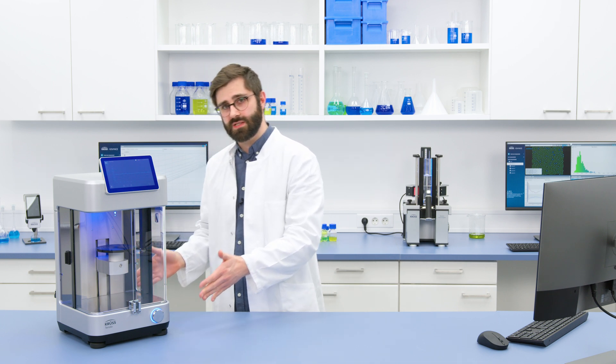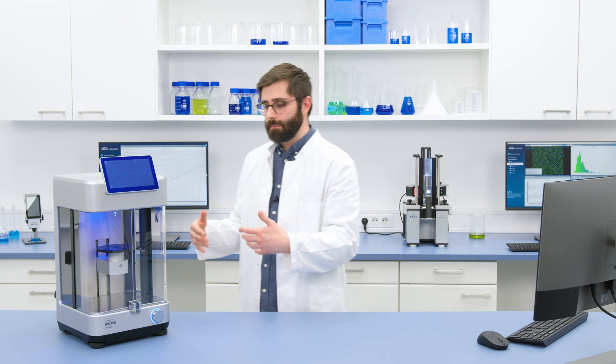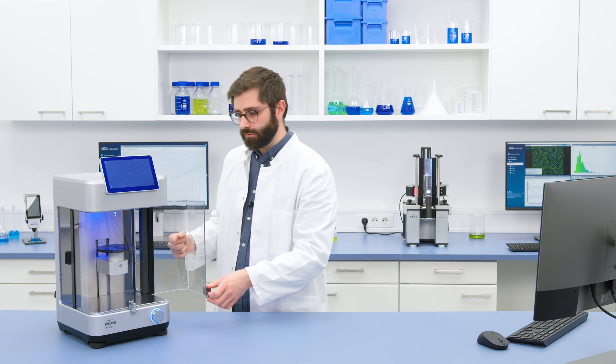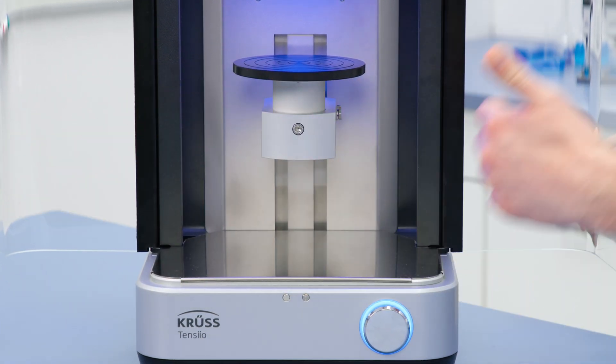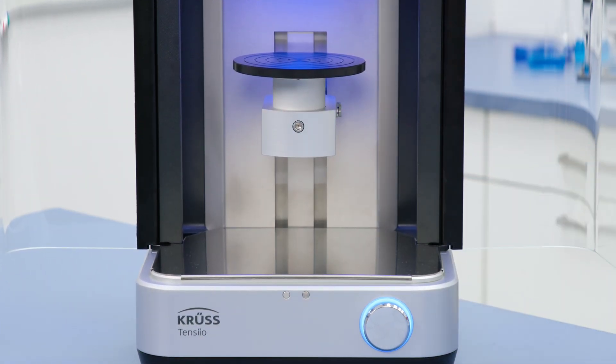It has a very small footprint which is unobtrusive, but still you get a lot of room to work. You can open the doors up really wide and you can gain access to the sample chamber very easily.